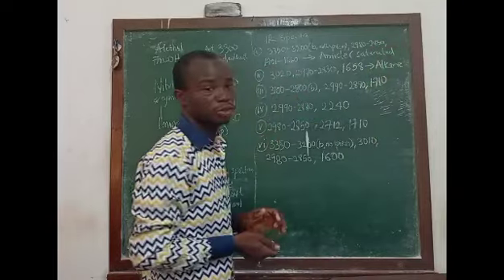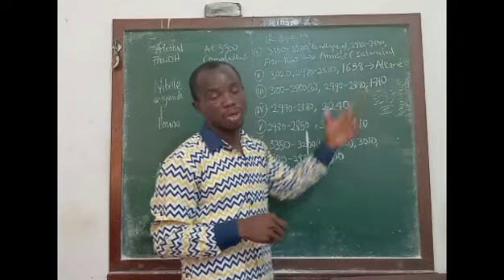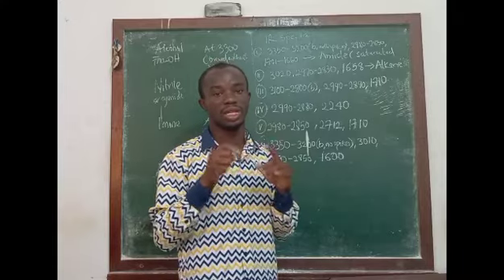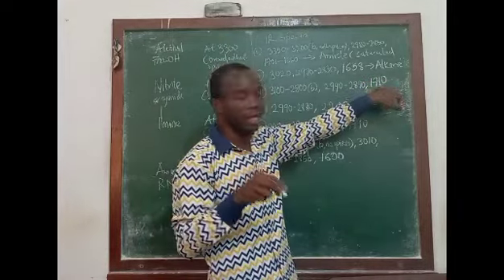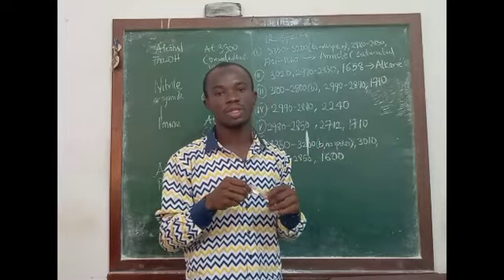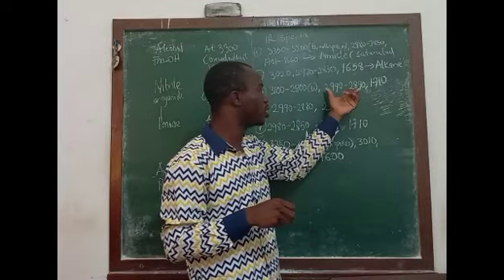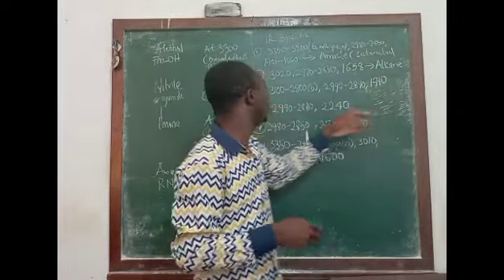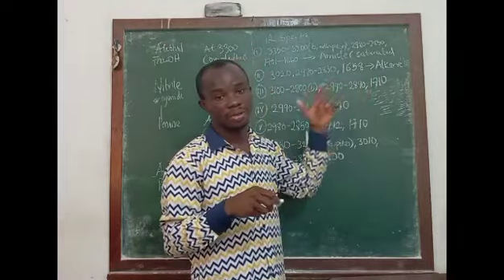For the next spectrum, we also have a signal just below 3000, which represents saturated carbon in the IR spectrum. We also have a signal at 1710. A signal at 1710 means the spectrum is for a carbonyl. Since we have a signal just below 3000 and a carbonyl functional group, the question is, which class of carbonyl does this represent?